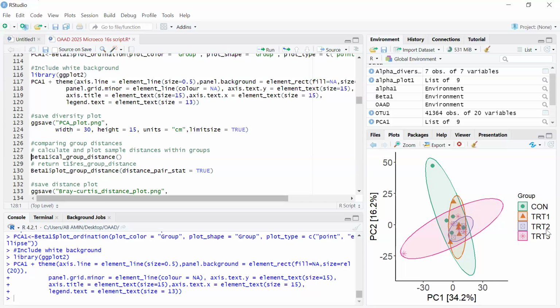What I'm saying here is the PCA and the PCoA graphs are almost the same. The ellipses are the same in a way, and all the keys there are also the same. When you talk about closeness, you're also talking about values, that's numbers, if I may say so. Am I right?